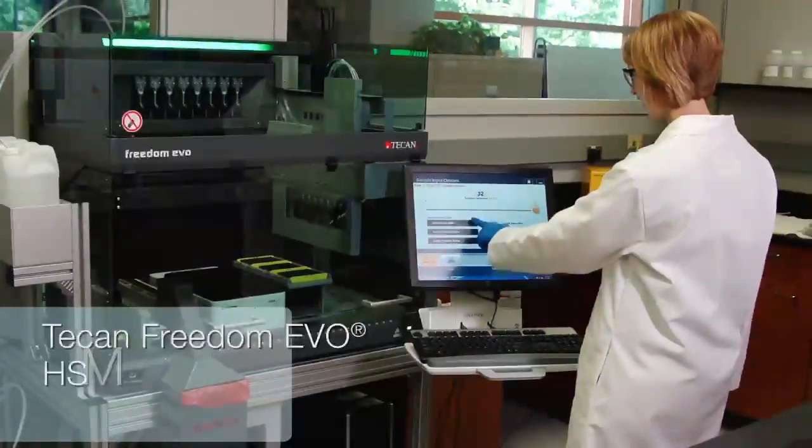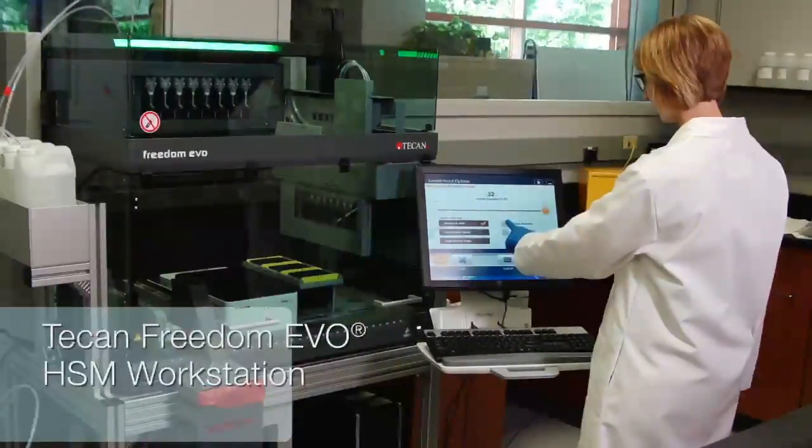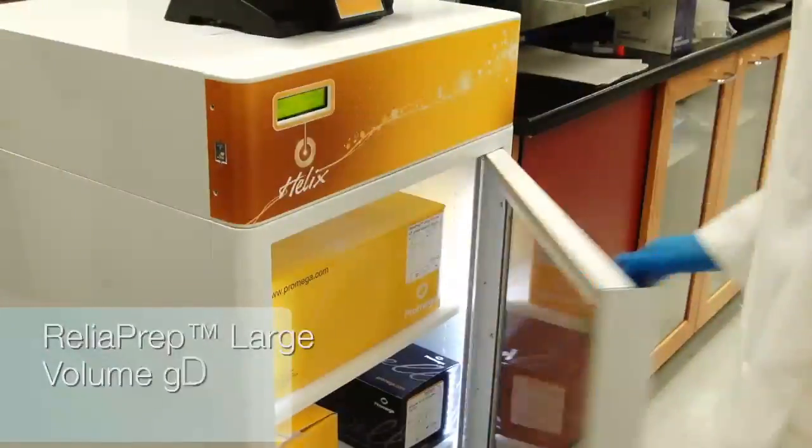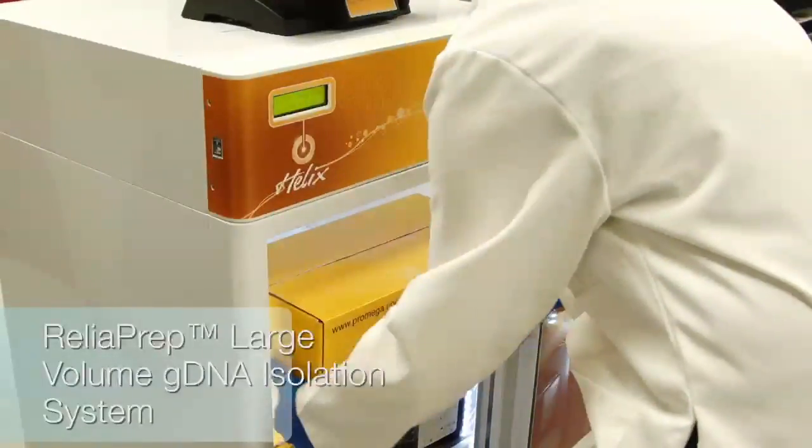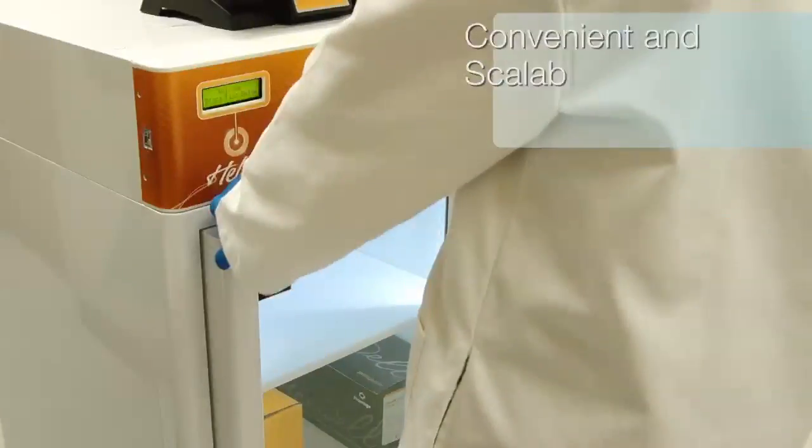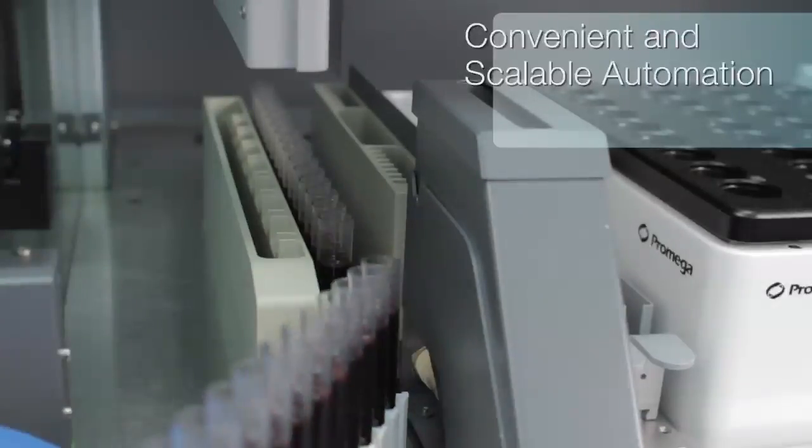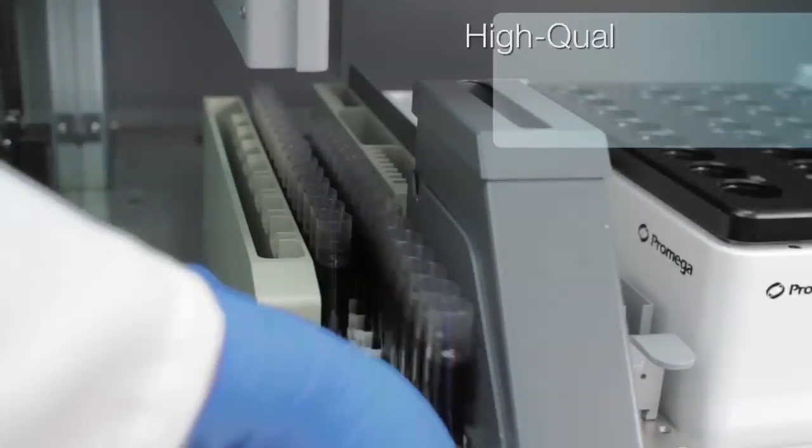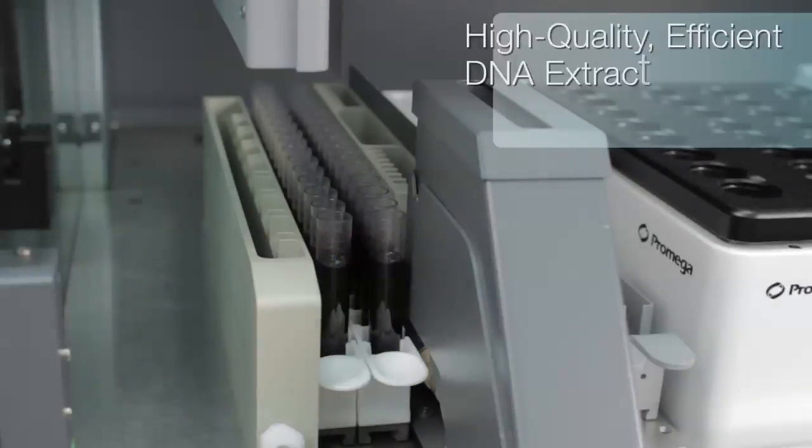Processing blood samples on the TKAN Freedom EVO HSM workstation using the PROMEGA ReliaPREP large-volume gDNA isolation system provides unparalleled convenience and scalability along with the quality and efficiency required by high-throughput genomics labs.